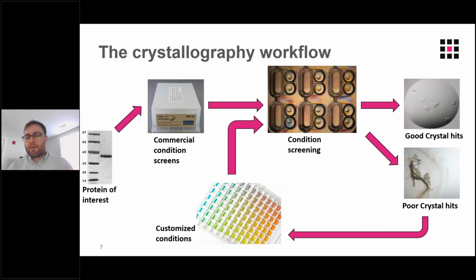So now that we've watched that video, I'm going to break it down in a more picture format of what was going on. So in a typical crystallography lab setting, you have a protein or macromolecule of interest, shown on the left here.